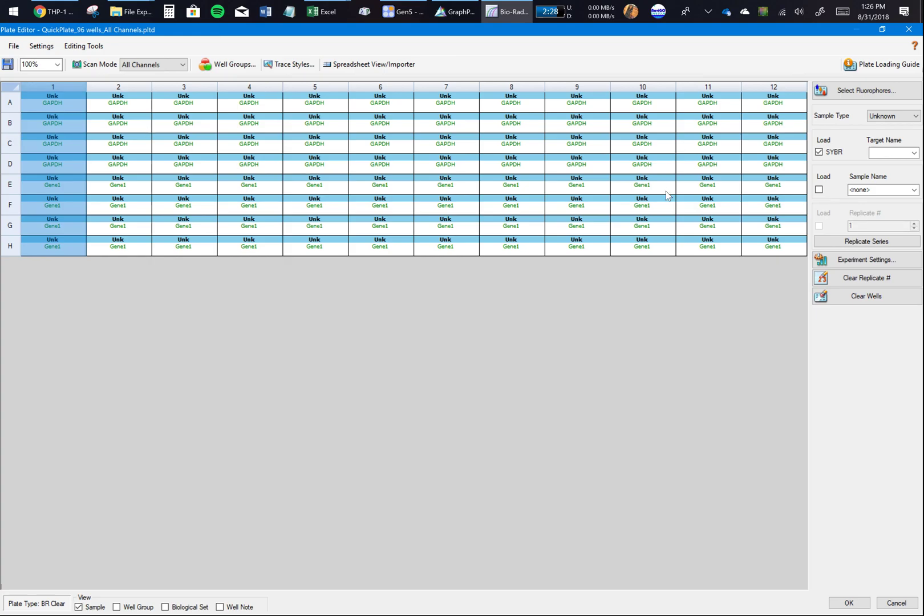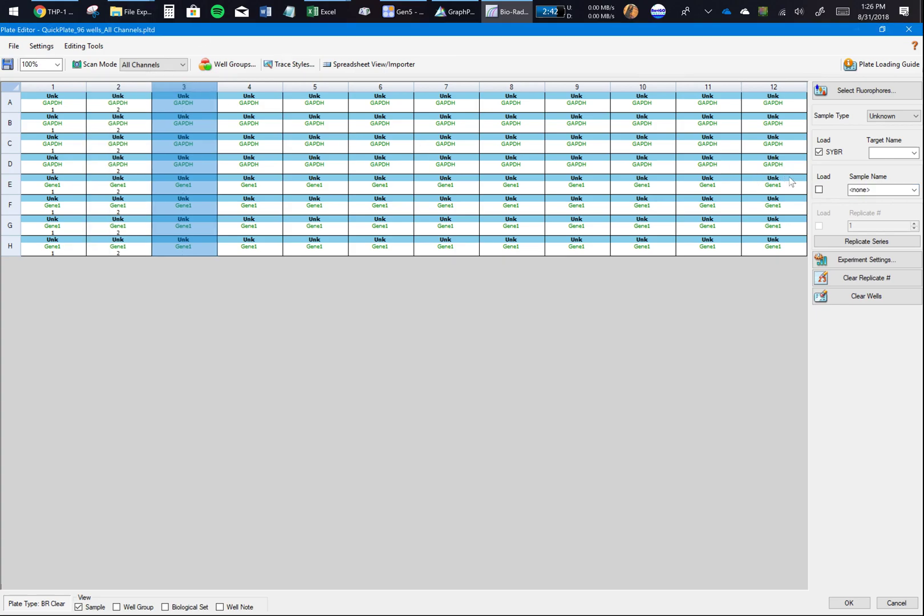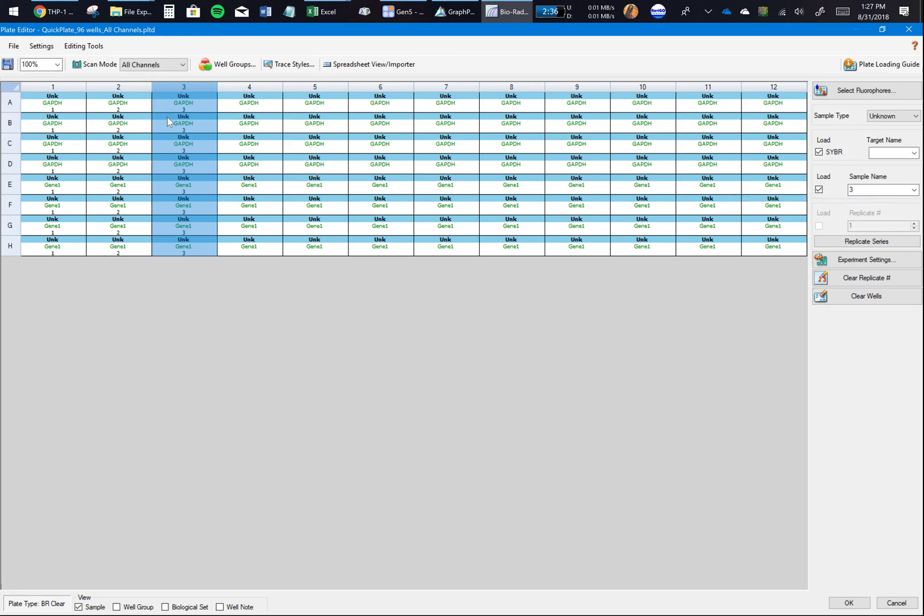Remember, whatever you write here doesn't matter to the software - it's just for your identification. If you write something like GAPDH123, the software won't call it invalid. It's just an identifier for you to know. Now let's say I have one more gene - I'll just say Gene 1.